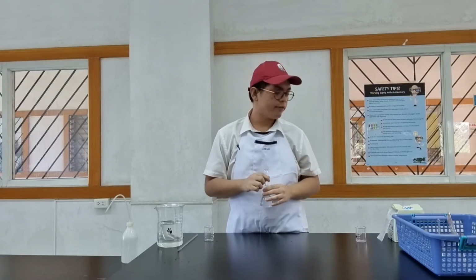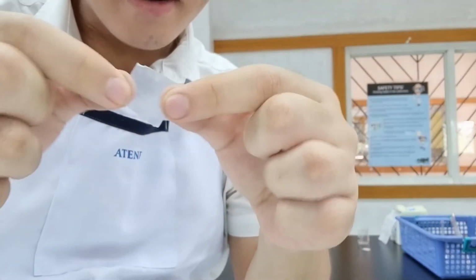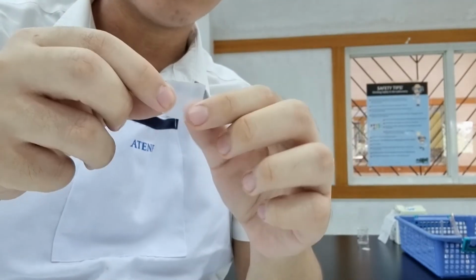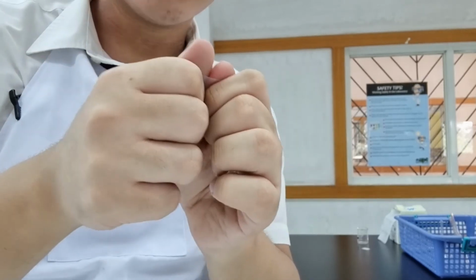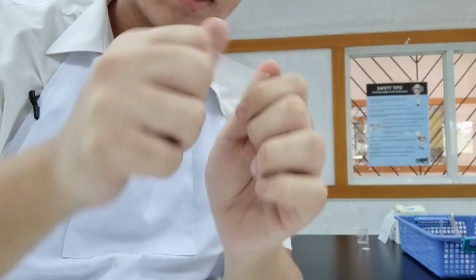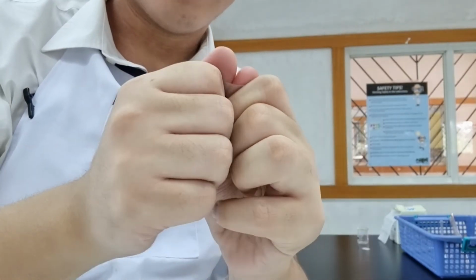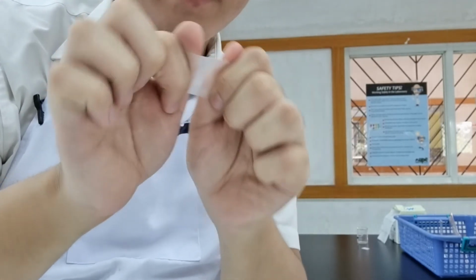This volumetric flask doesn't have a cap, so I'm going to use parafilm instead. Parafilm is an inert type of material that we use to seal stuff. I'll just get a small amount. So this is the amount of parafilm that I will be using to cover my volumetric flask. I don't need a lot because to use parafilm, you stretch it both directions, x-axis, y-axis, and now you have a material that has the consistency of something like cling wrap.